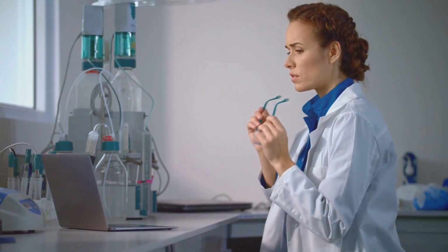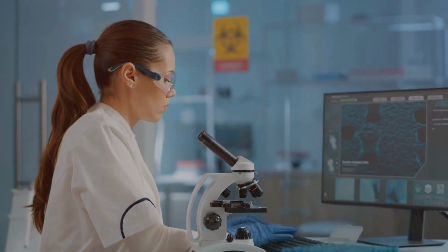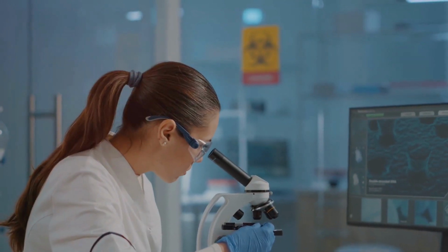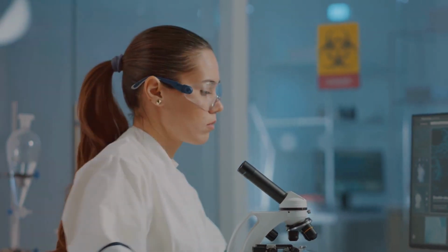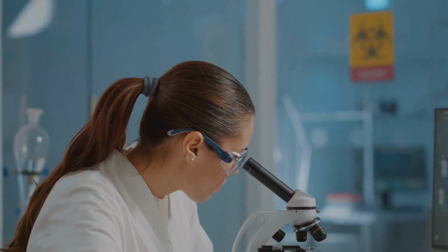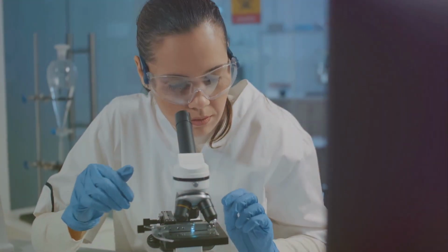Starting with calcium phosphate transfection, this process involves creating a precipitate of calcium phosphate and DNA. The cells then engulf this precipitate, granting the DNA access to the inside. This method is relatively simple and cost-effective, making it a popular choice for many researchers. However, it's not all rosy. The downside is that it's a bit unpredictable and can be toxic to some sensitive cell types.